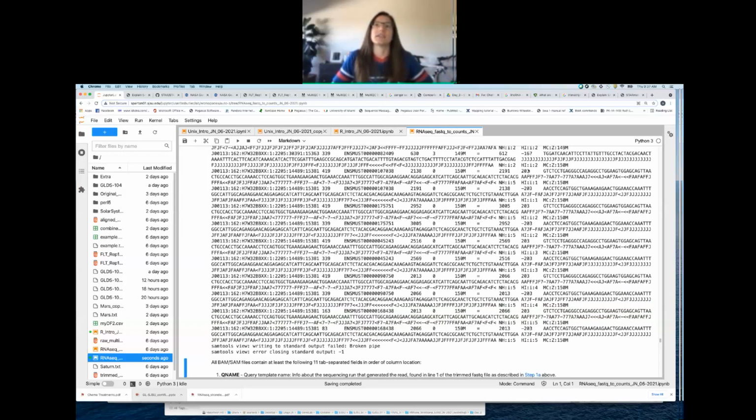And so we can see here that that next mate pair that maps to 5 different locations on the genome, represented by the 5 transcripts, is 203. So we see 203, and then this is that one transcript that we saw before, 203 again here for the aligning to the same strand, aligning to the opposite strand of the reference. We see this next transcript here, and then we see the 3rd transcript that it aligned to, and then these are the 4 new lines that we just looked at by adding that -n option to the head function.